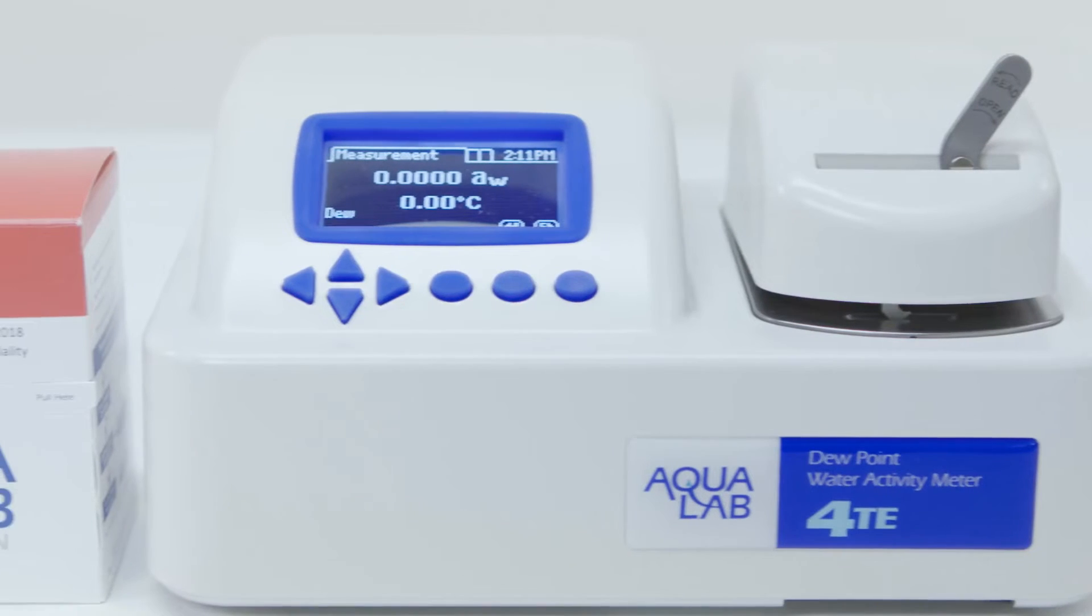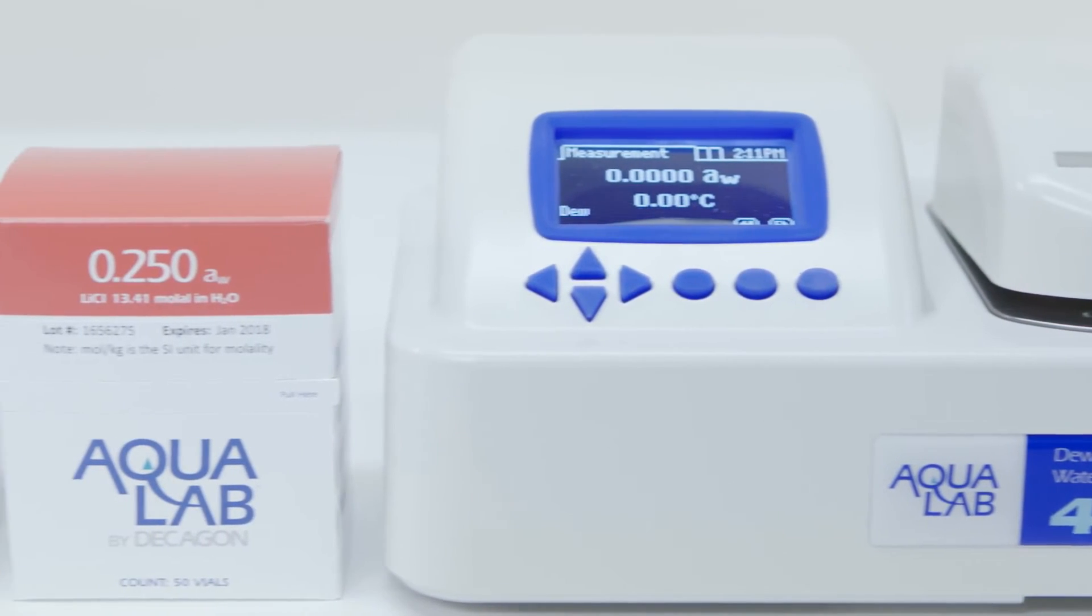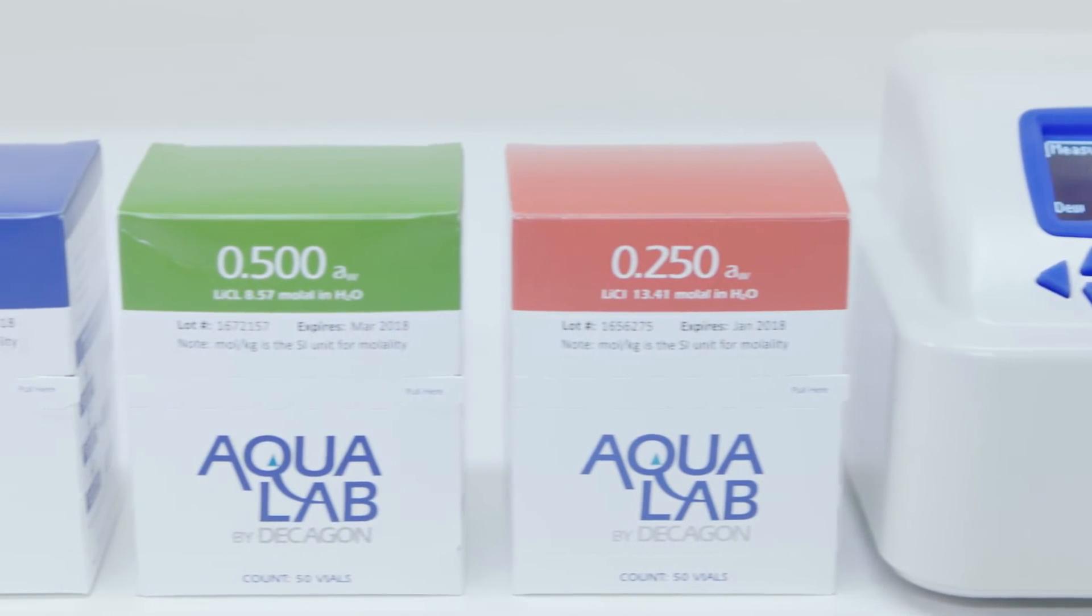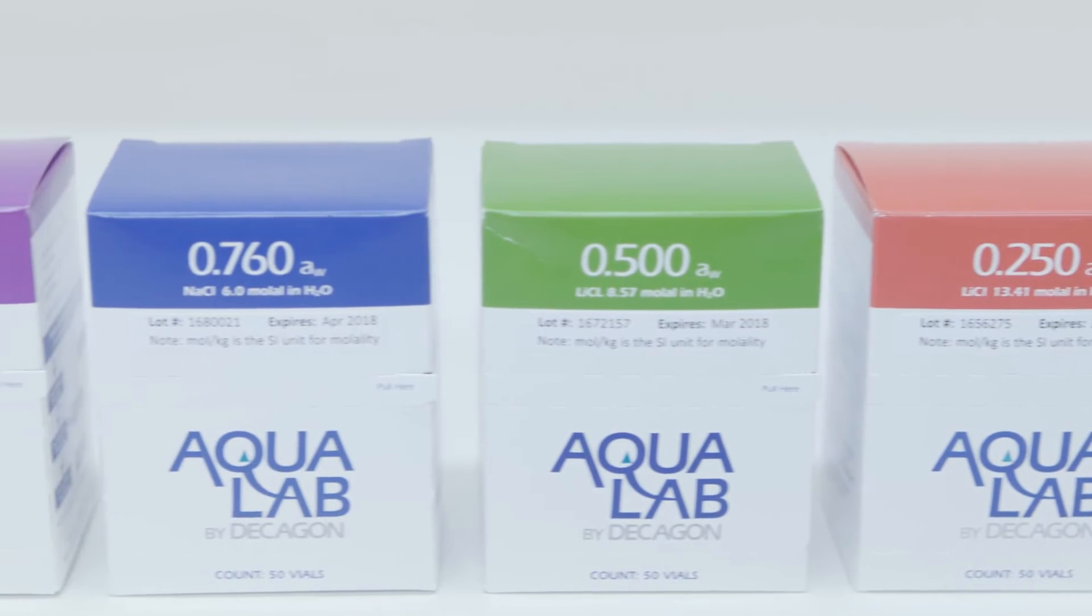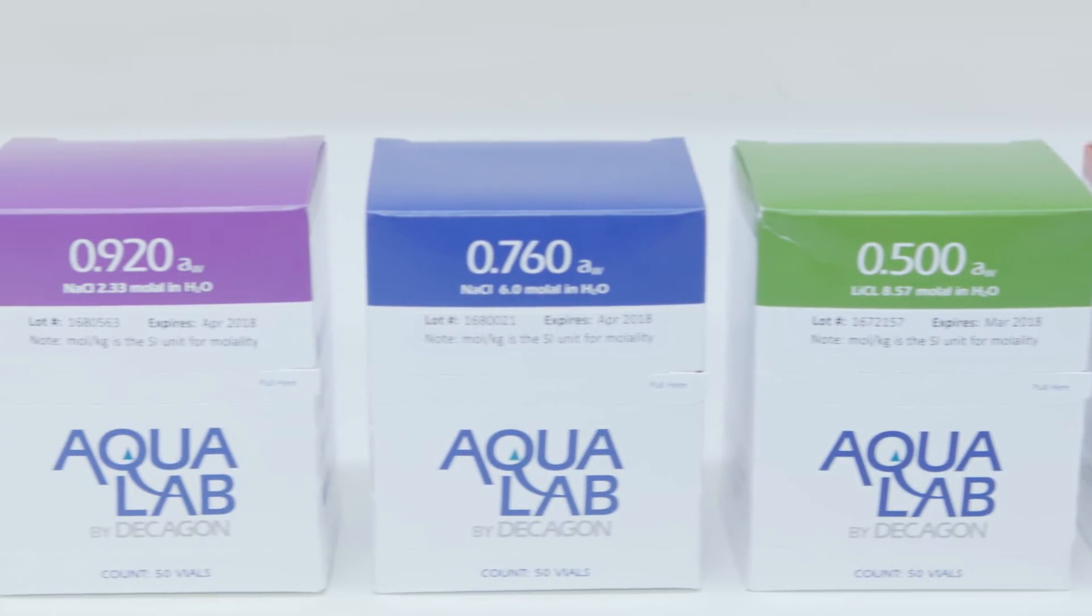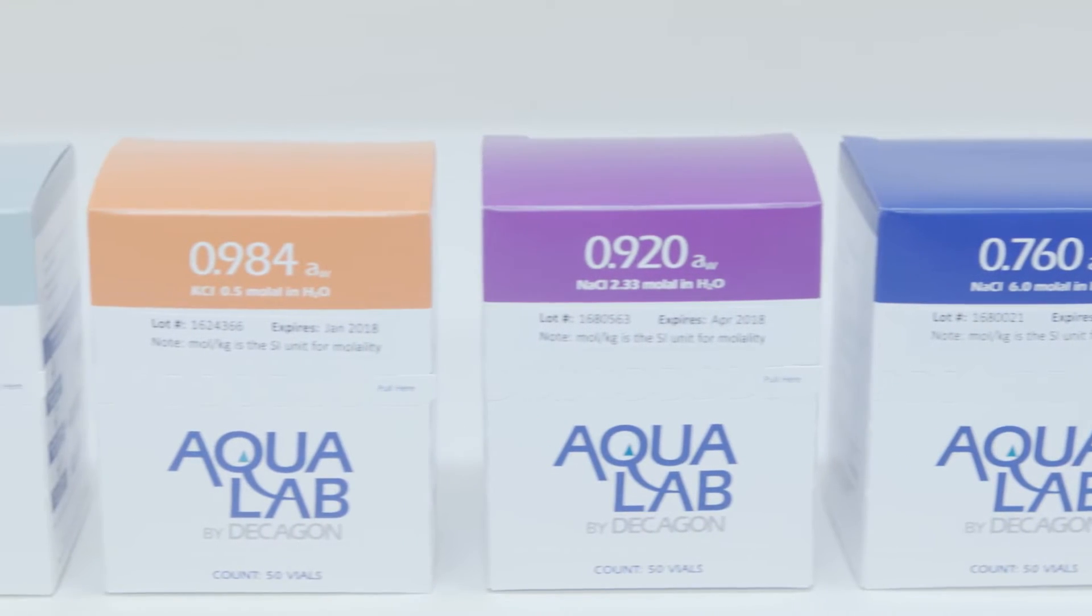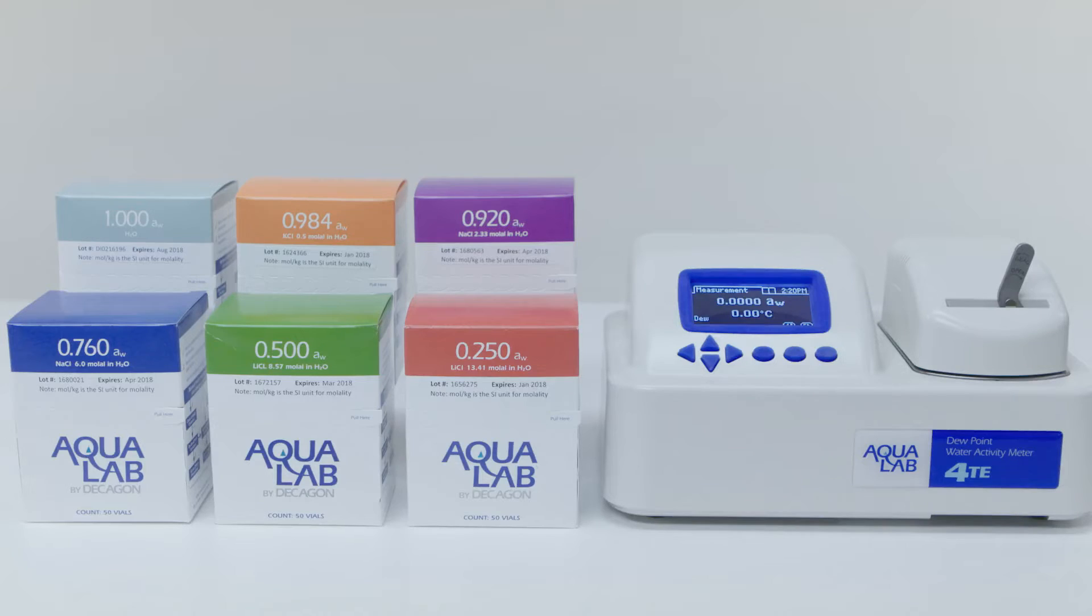There are five verification standards available for your instrument: 0.250, 0.500, 0.760, 0.920, and 0.984. These salt solutions are tested with a densimeter, which allows us to know their concentration very accurately.